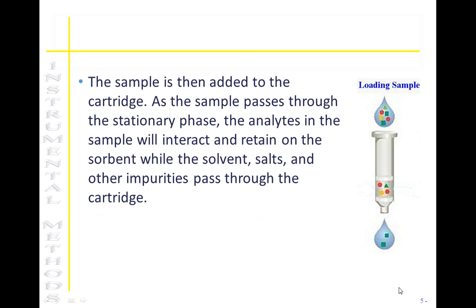Then the sample will be added into that cartridge itself, and depending on the interaction between the analyte and that stationary phase, some of the materials are going to be absorbed into that stationary phase and retained, while other materials will be allowed to pass through the cartridge itself.